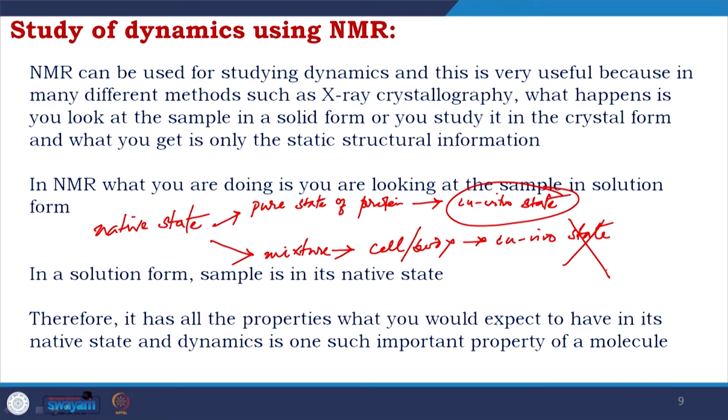Okay. So, yes, it is not exactly the function of a protein inside the body of a human or the body of a mouse, or at least in a cell, it is about the pure protein, but still there are clear advantages over other techniques like crystallography.